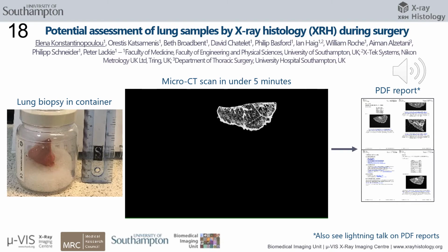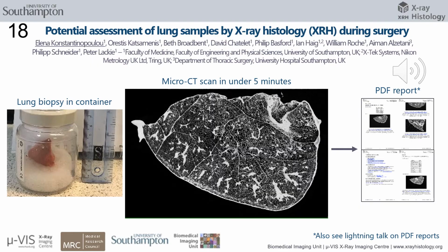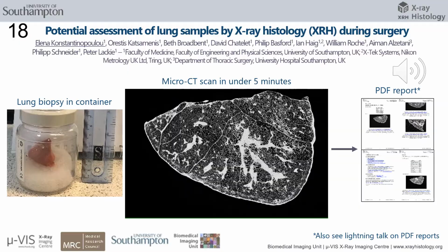To summarize, fresh lung tissue imaged by 3D X-ray histology in under 5 minutes has great potential to help support lung surgery in the future.